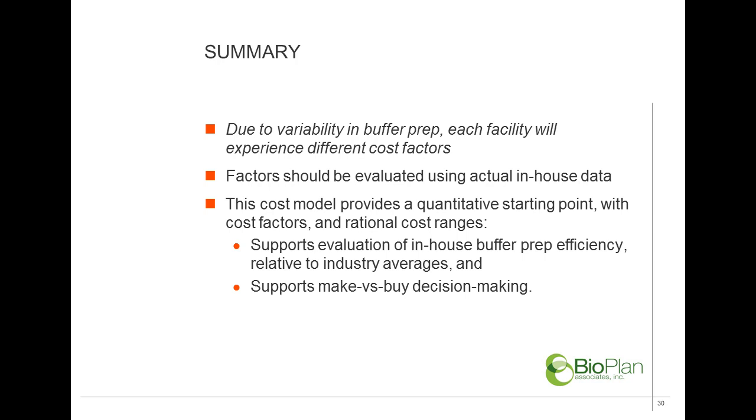It requires going in and putting in numbers directly related to your facility and the factors that are most important to you. The factors should be evaluated using actual in-house data. However, the ranges that we've provided, based on the interviews we conducted to put this model together, provide what I believe is a relatively good starting point to quantitatively identify each individual line item cost factor and the ranges that may relate to your facility.